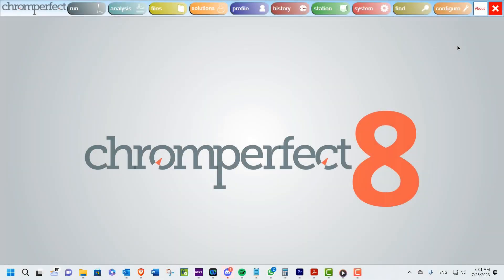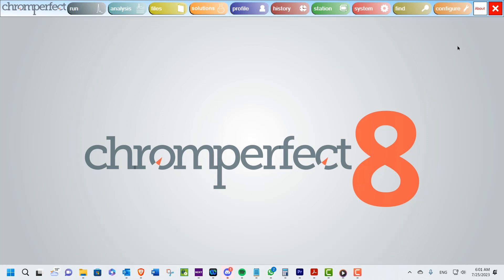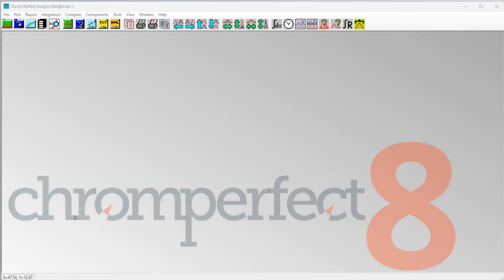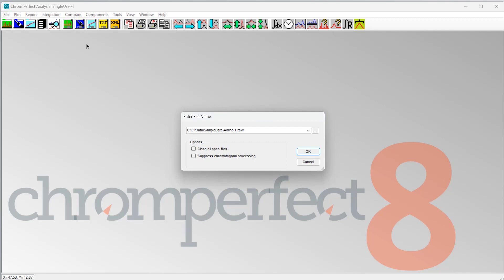Welcome to this ChromePerfect user training video. Today we are continuing to work through the main manual and will focus on updating the calibration file within the analysis program. The program is opened by selecting the Analyze button on the main menu. We are using ChromePerfect version 8 and Windows 11; other versions and operating systems might appear differently, and you should consult the manuals supplied with the software.